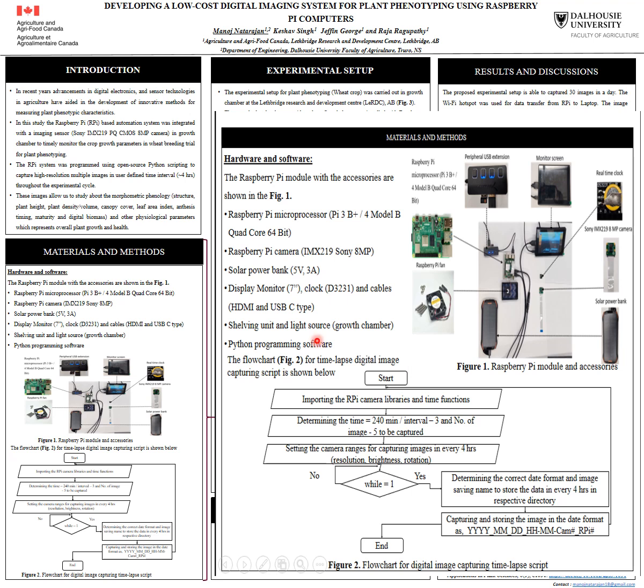open source Python 3 was utilized as the primary programming language to command the board and the camera to capture the image at user-defined time points. Necessary libraries were installed to create a time-lapse imaging algorithm to capture the image every 4 hours. Initially, the program was automatically adjusted for white balance, brightness, maximum image resolution, frame rate, exposure mode, and shutter speed associated with the variable growth chamber lighting condition.